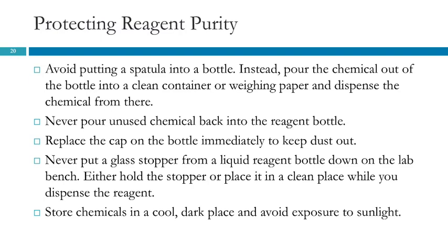So it depends on what you're using it for, right? If that was for trace metal analysis and you're using a metal spatula and hammering it in there, yeah, you're probably introducing some metal ions. For your purposes, it didn't matter, so it was absolutely fine. But that's the standard when you're working with very, very delicate things where you need real high accuracy. That's where those little weighing bottles come in handy. So you pour the chemical into the weighing bottle and you use the weighing bottle to measure out your substance. Of course, the weighing bottle has to be clean.